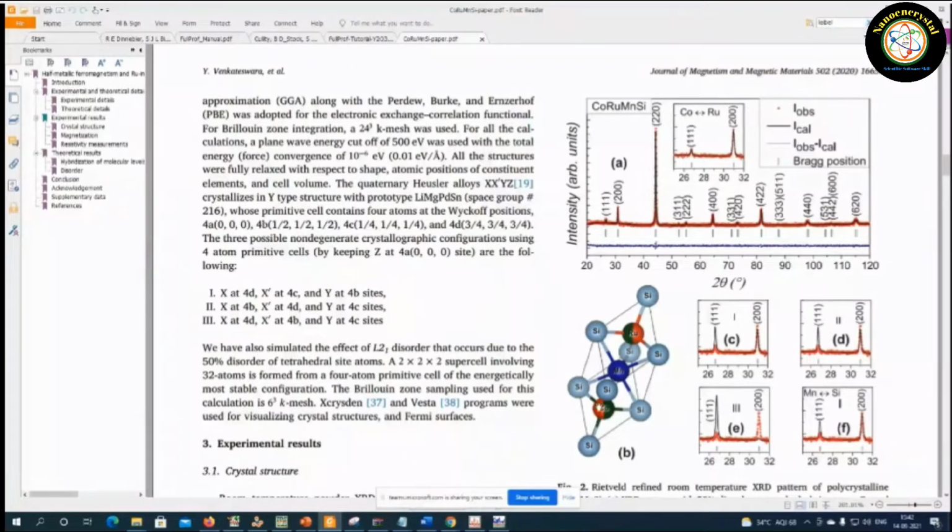So the student has to investigate different site occupancies and do the refinement for different configurations. Like if I do it for the first configuration, second, then they didn't match for one peak. So one has to look for the intensity mismatch in this structural refinement.